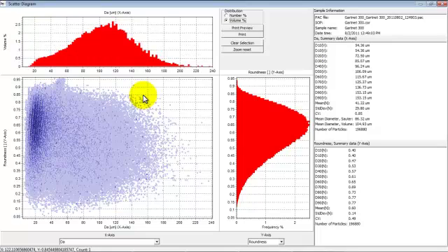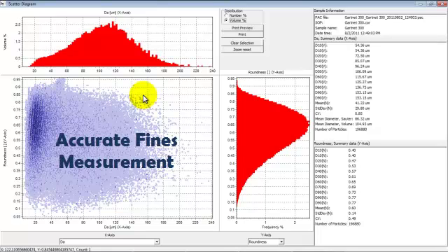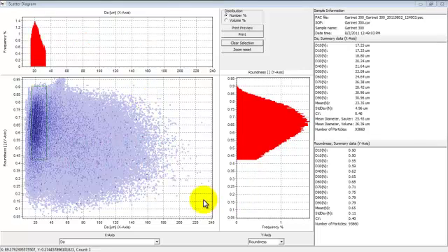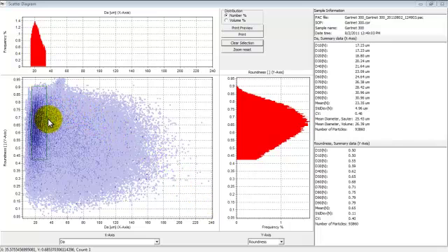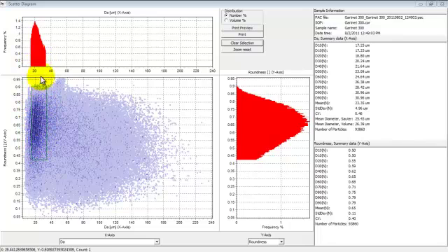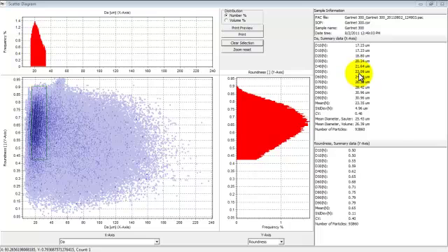Volume distributions are reported by traditional sizing techniques. One of the many features of image analysis is accurate fines measurement when viewed in the number distribution. A very significant advantage of image analysis is the ability to isolate an area of the scattergram. So we've isolated this area of the scattergram down in the fines mode of the number distribution for area equivalent diameter. When we did that, all of the summary data changed to represent only the particles within this area of the scattergram, and the d50 value for the area equivalent diameter decreased from 29 microns to 23 microns.